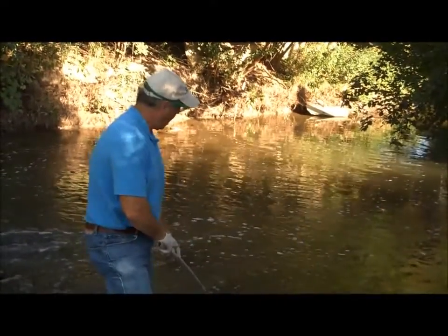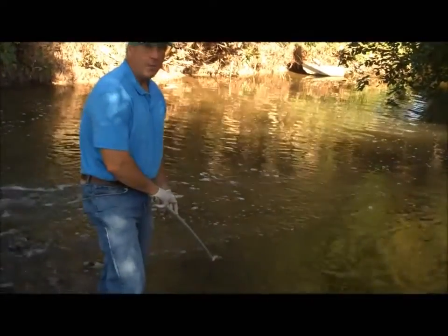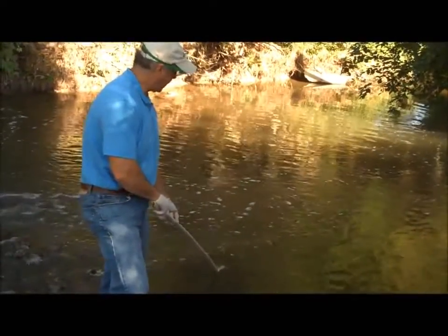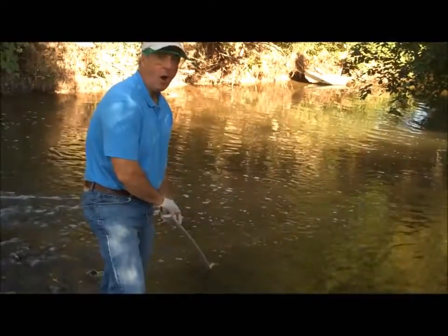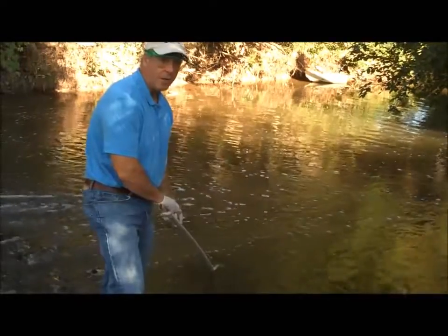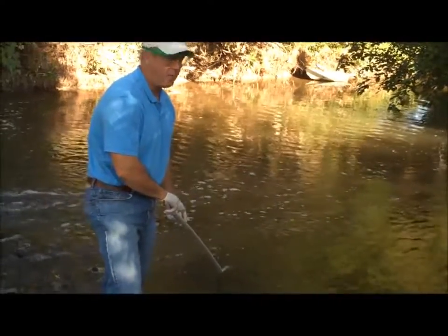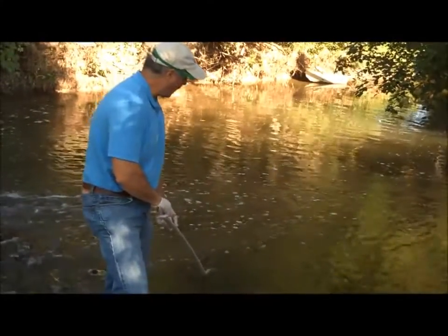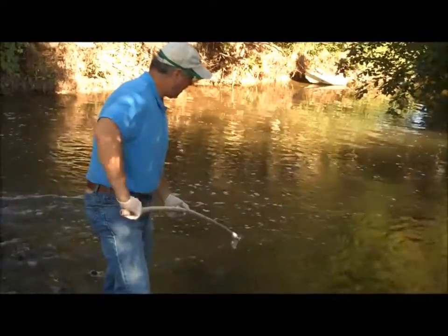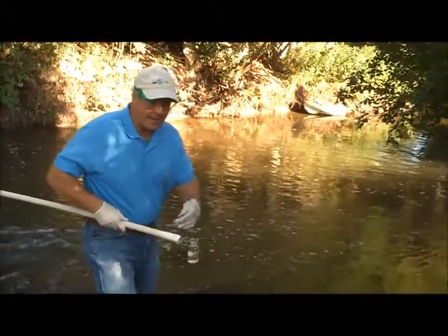up under the water. It needs to be below the surface of the water when you collect it, perhaps 4 to 5 inches deep. You're going to let it sit there for a moment and rock it back and forth to get all of the air bubbles out. You don't want to collect any air bubbles in your sample, especially if you're dissolved oxygen, biochemical oxygen demand. Then you're going to let it rock for a while, and you're going to bring it up, and then pull it back towards you this way, and then it's ready to cap.